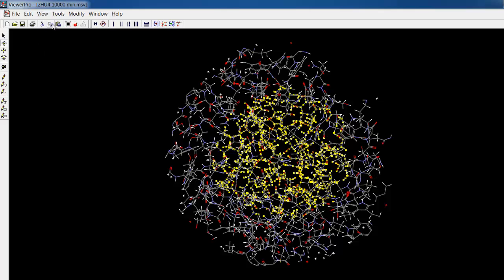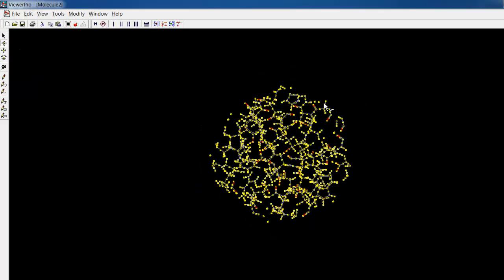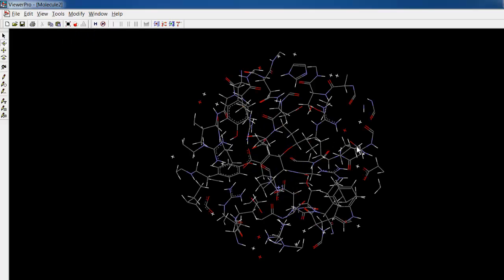I'd now like you to hit copy, open a new window or new canvas, and then hit paste. We've now pasted all of this exciting stuff, including our medicine right here. We'll now deselect it by clicking out here in the canvas. Let's go ahead and zoom in by clicking the black box fit to screen.